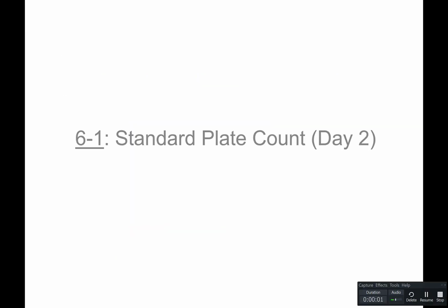So now we're going to go through day 2 and talk about the readout. So on day 1, we would set up our experiment, perform our serial dilutions, and then plate them onto plates. And so when we would come into the next class period, we would do our readout to determine our titer. And so we're going to talk about how we do our calculations.